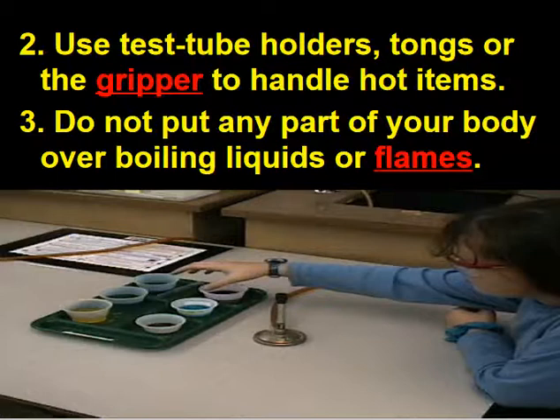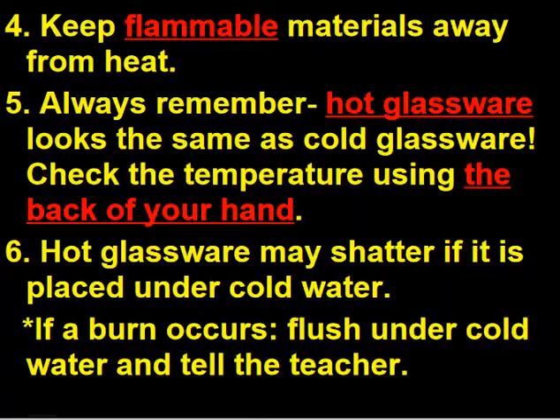Now, use test tube holders, tongs, or grippers to handle hot items. Don't put any part of your body over boiling liquids or flames, and you can see this person putting their arm over the Bunsen burner. Keep flammable materials away from heat. Always remember, hot glassware looks the same as cold glassware. So check the temperature using the back of your hand.